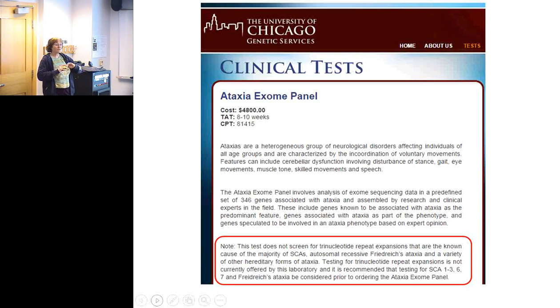So it's very generous in terms of anything that could possibly be confused with ataxia via sequencing in this case. And what she's doing is clinical sequencing, up to 75-fold coverage, which is more than what we usually do for research. Anything that she reports back to the patient, she actually Sanger verifies, which is a lot of work and which is why this is relatively expensive.